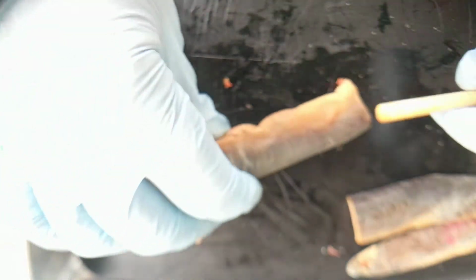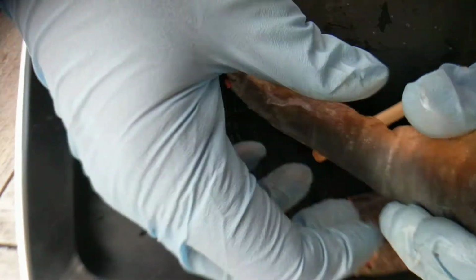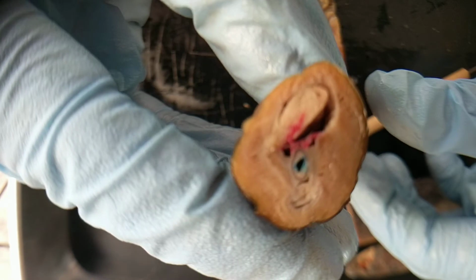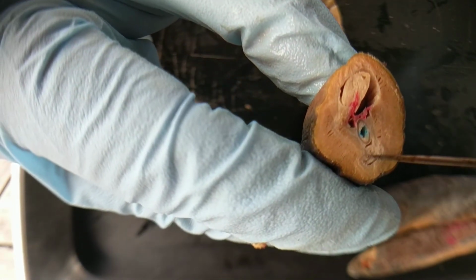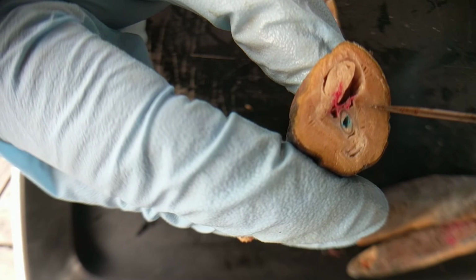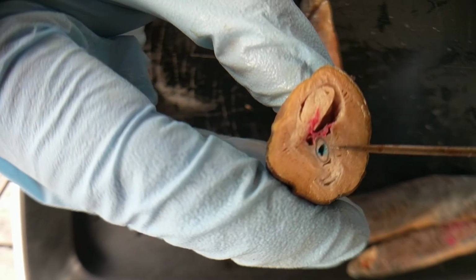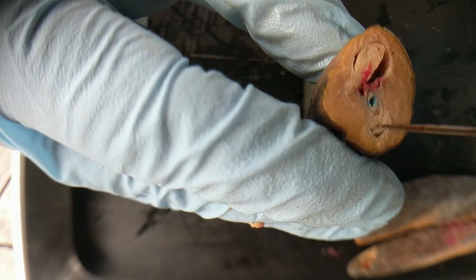So then the last piece I'm going to show you on here is the trunk transverse section. Transverse means a cross section. So this is through the trunk area. You can see the orientation of the notochord, nerve cord, dorsal aorta, myomeres, and in this case we see a bit of the liver here. This is all the myomeres on the side. This is the muscle. This blue one is easy to identify because they injected the latex in the blood vessels. This is a vein, a big cardinal vein, and this is the notochord.